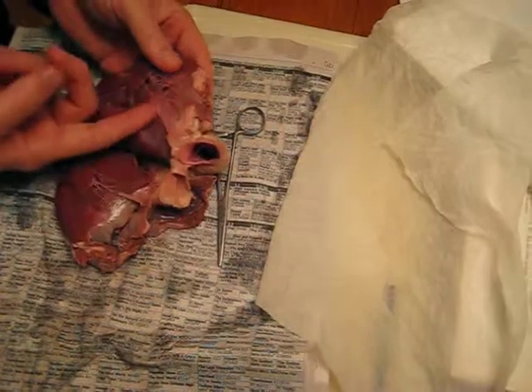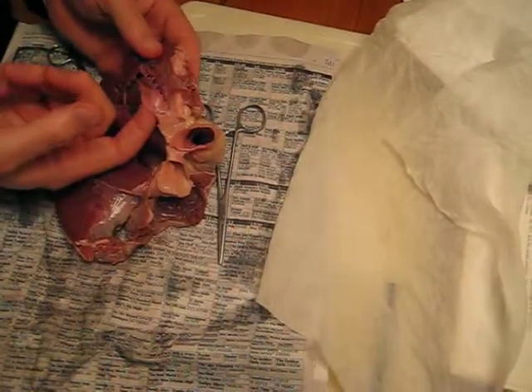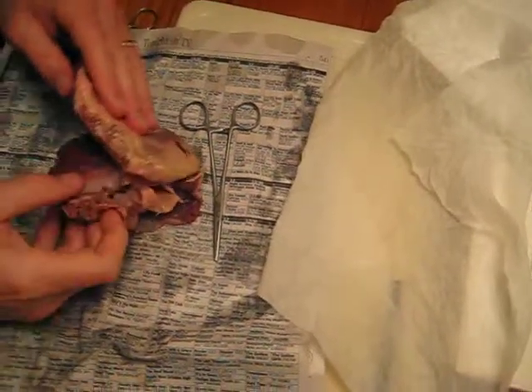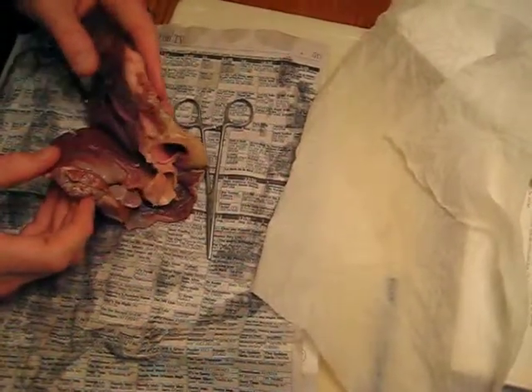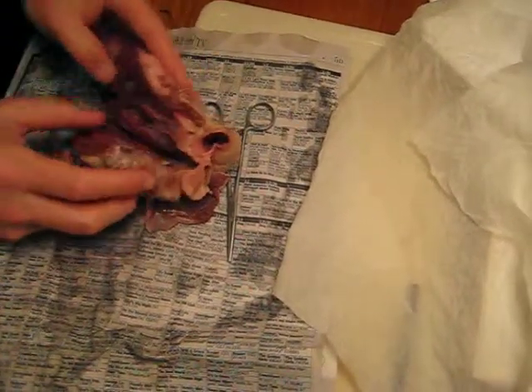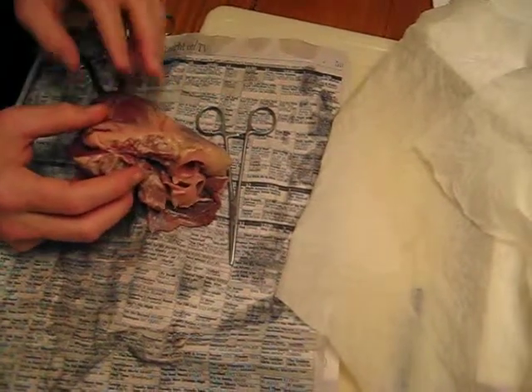So when blood comes behind it and pushes on it, this flap goes up, and in fact it'll all close. That'll close that whole aperture. It's beautifully designed to do that. It's a little hard to see, but that's what you can explain. You've got to tell them that this big chamber, this big thick thing, is what allows you to pump blood to the whole body.